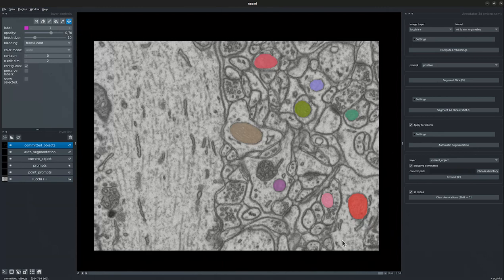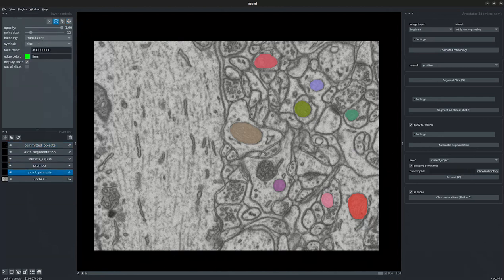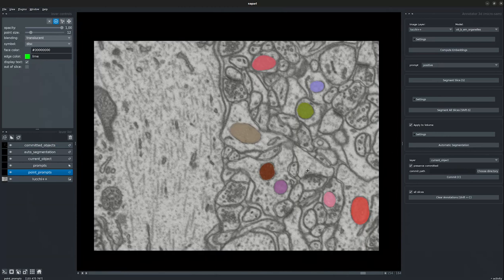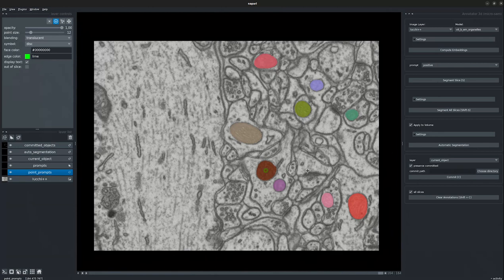Now let's get started with interactively annotating these objects. We choose the point prompt first, mark a positive point prompt on the object, and segment this slice using the S key binding. We use Shift+S to segment across all frames. We see all the frames have been segmented for the particular object. Segmenting the object across all frames takes roughly under 5 seconds. We go ahead and commit this.